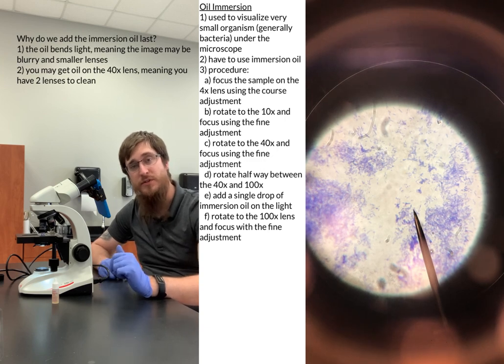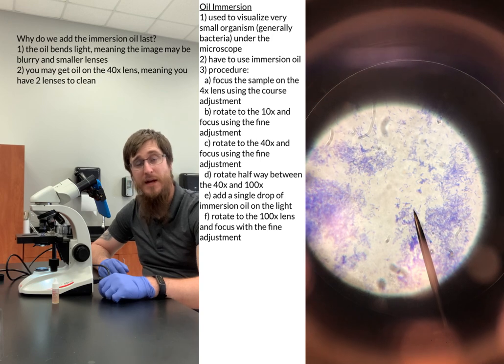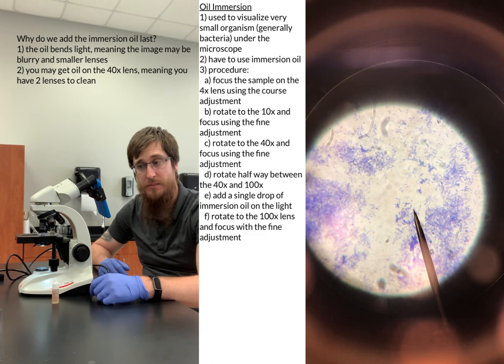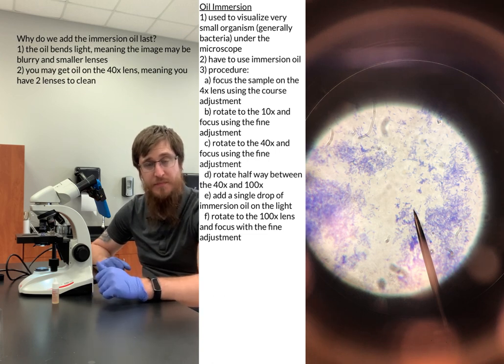The biggest way that you know that you goofed on this is if the slide actually pops off the microscope. That can happen just from the pressure of it being pushed down onto the slide. So let's avoid that basically.